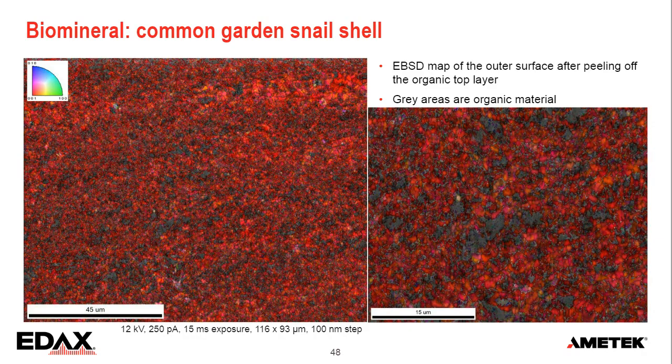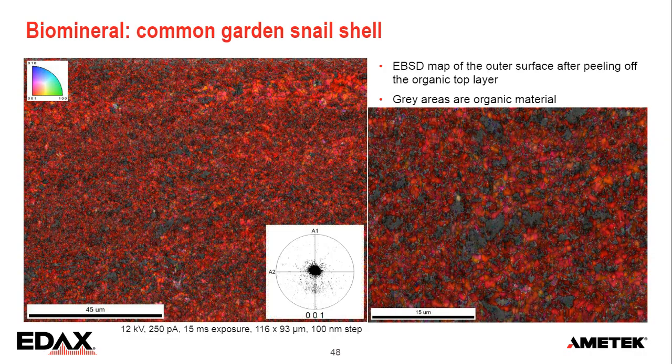So also here, it's a very strong organic control of the crystal direction. And interestingly, in the shell we just had, the aragonite forms little platelets, and that's the smooth nacre that we're all familiar with. And in the snail, they're just very small grains, but they don't form the same dihedral crystals on the surface. But the orientation is the same. So it's the C-axis coming straight out of the shell surface.